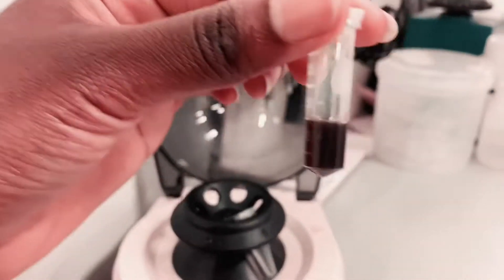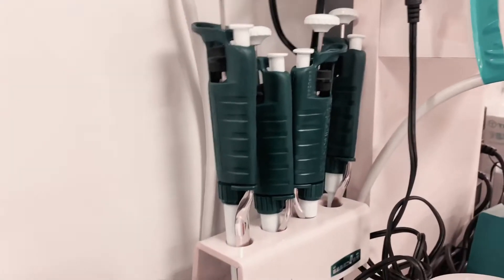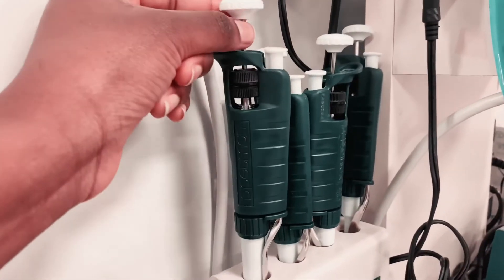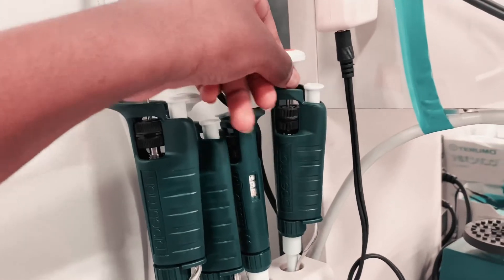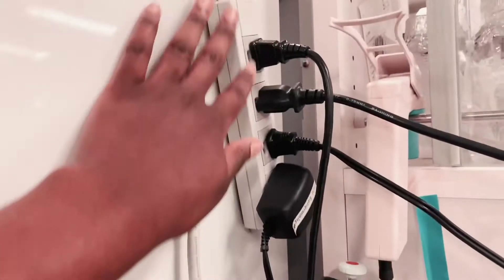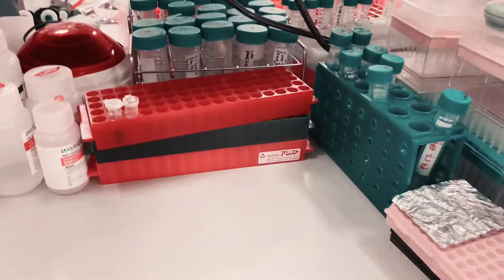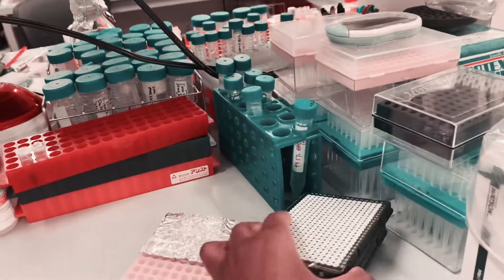I have my pipette holder — I don't know what brand this is. I have things in order: the P1000, P200, P20, and the P2. I also have this extension here and a magnet connected to it. I don't know why it's up there, but yeah. And then I have some tags like 'clean the aspirating tube.'